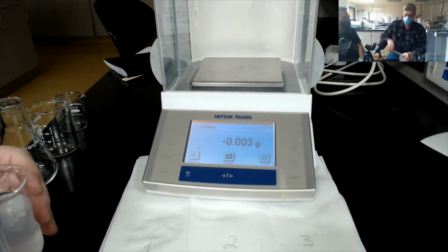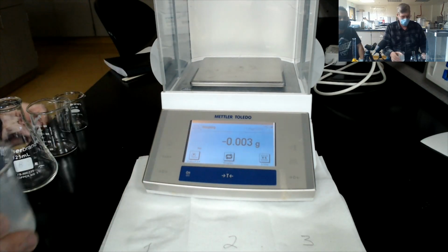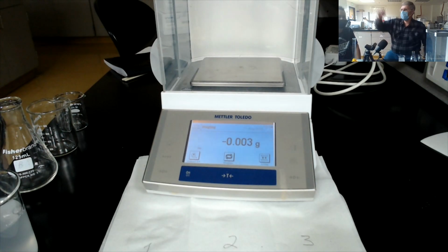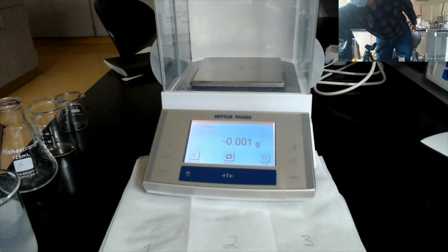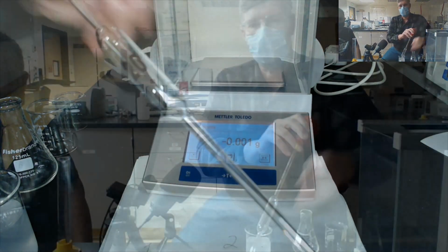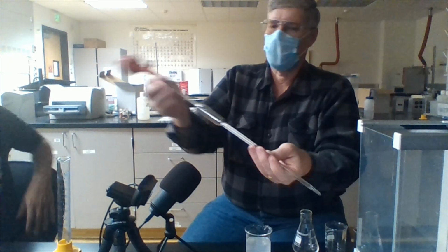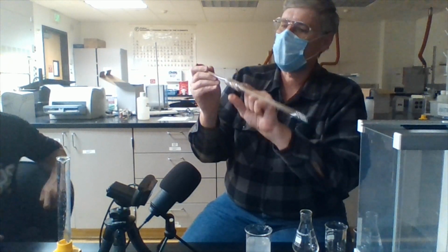We are now going to take the same unknown liquid and use a different measuring device for the volume. It's called a volumetric pipette. Volumetric pipettes have only one line on them.